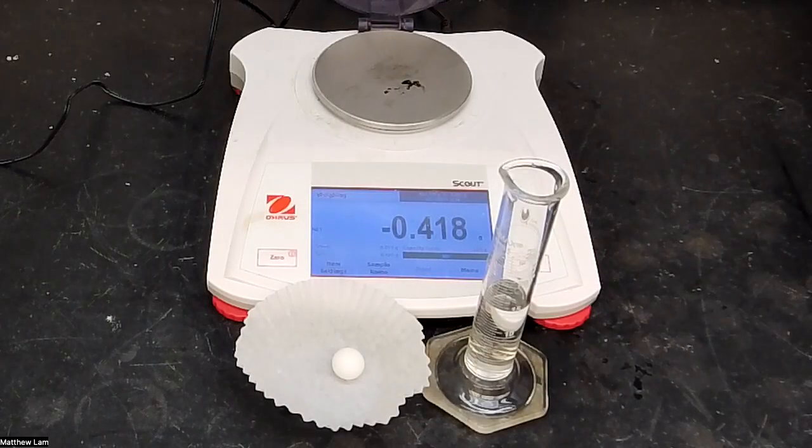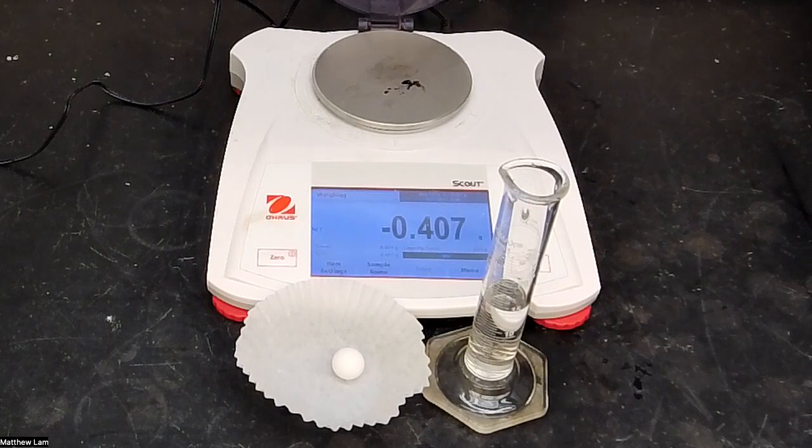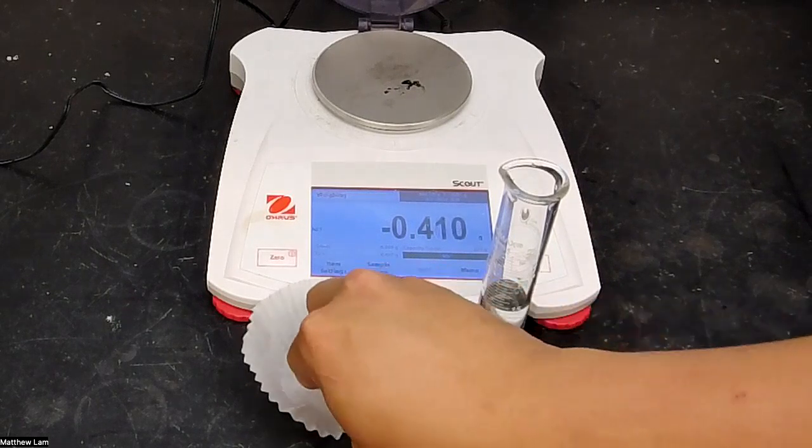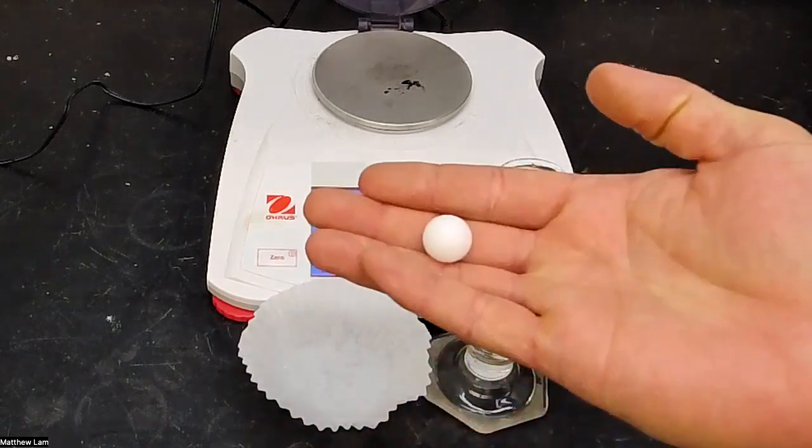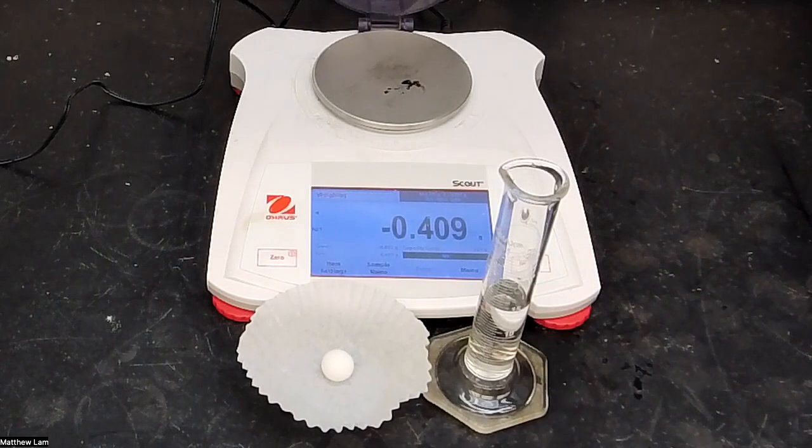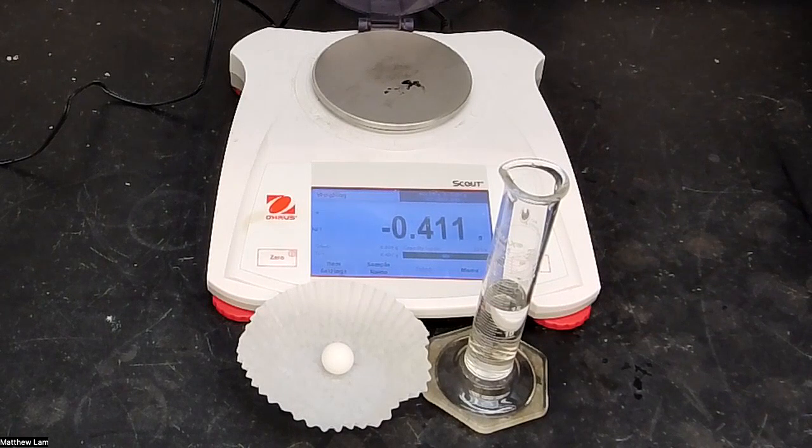Hello, Chem 161 students. Today we're going to be doing the density experiment. Basically, we're going to be determining the density of this Teflon ball right here. To determine that, we're going to take the mass and volume of the ball and determine the density.